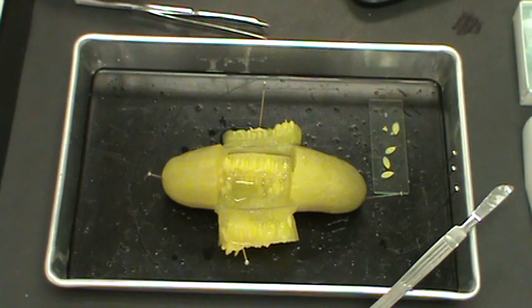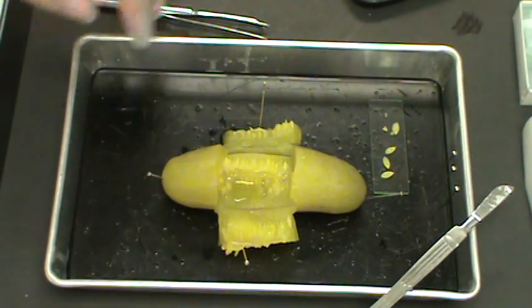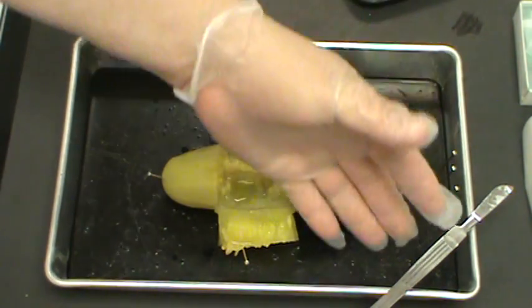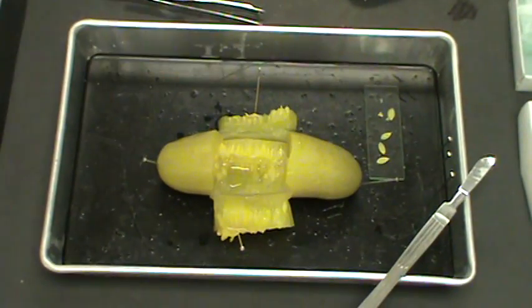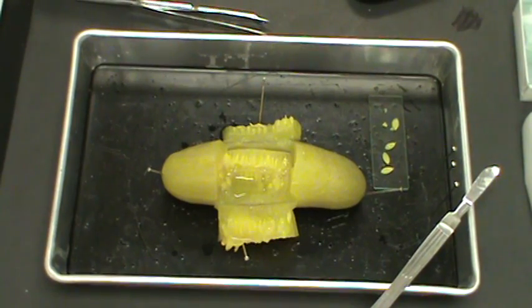This is what I'm going to tell you because it's exactly what I told my students. Even though we have taken every effort to sanitize the wax, the tray, the pens, the instruments, I cannot guarantee that this is a sanitary environment.